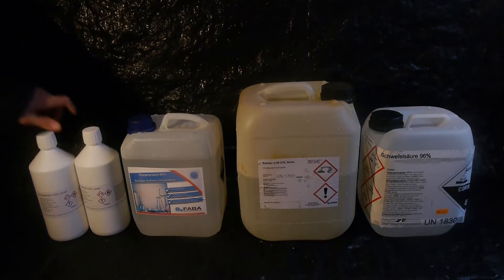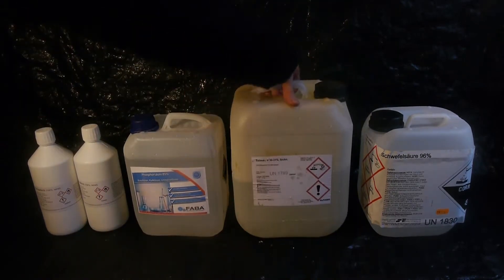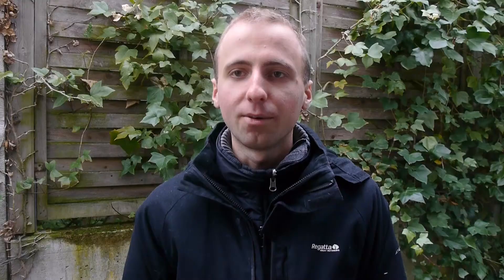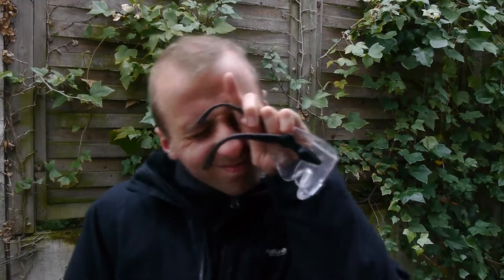Here I have some acetic acid, phosphoric acid, hydrochloric acid, and sulfuric acid in the order I will be performing the experiments. So that I don't have to worry about my eyes, I've got some base to neutralize — well, safety goggles might do a better job of that. The base we'll be using is sodium hydroxide, a very strong base commonly available in things like drain cleaner.